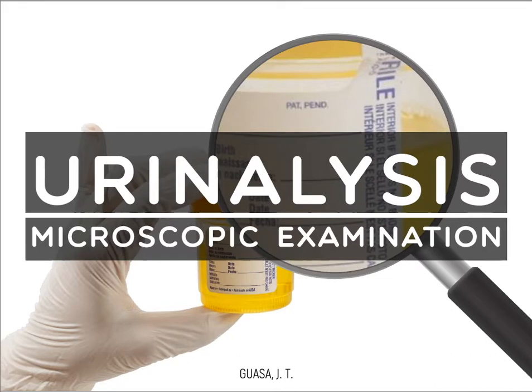Okay. So, microscopic analysis of urine is subject to several procedural variations, including the methods by which the sediment is prepared, pwede sad ang volume of the sediment examined, and the methods and equipment used for visualization, and the manner that they are reported. So, it is very important na as a laboratory, dapat standardize ato ang pag-reporting. As much as possible, we have to reduce errors para sa dili ta maglibog.